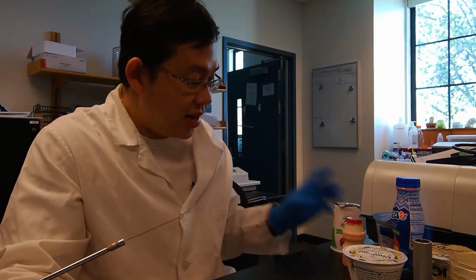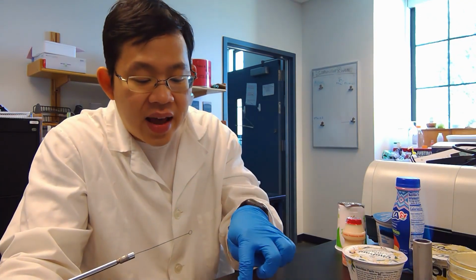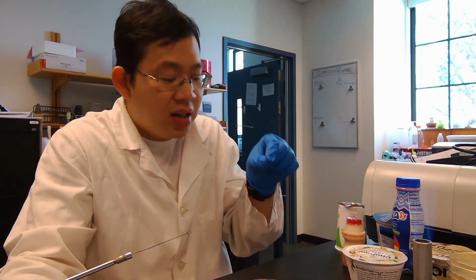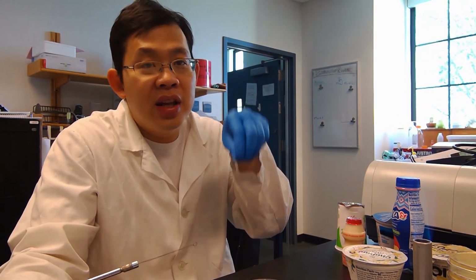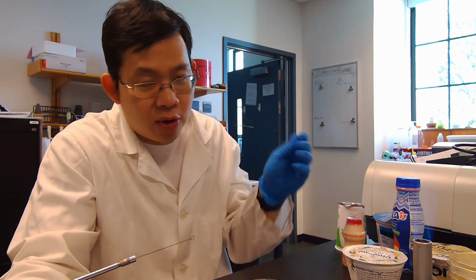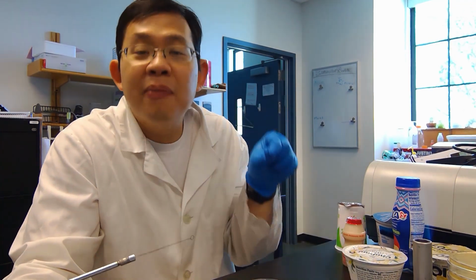One of the ways for you to get isolated colonies is to lower the cell density in this yogurt to a very, very minimum amount so that every single cell can land quite far apart on your agar, because what you want is for each individual cell to become an isolated colony away from each other. So that's what you want. That way, for the subsequent process, you can take a sample from that isolated colony and perform an experiment.